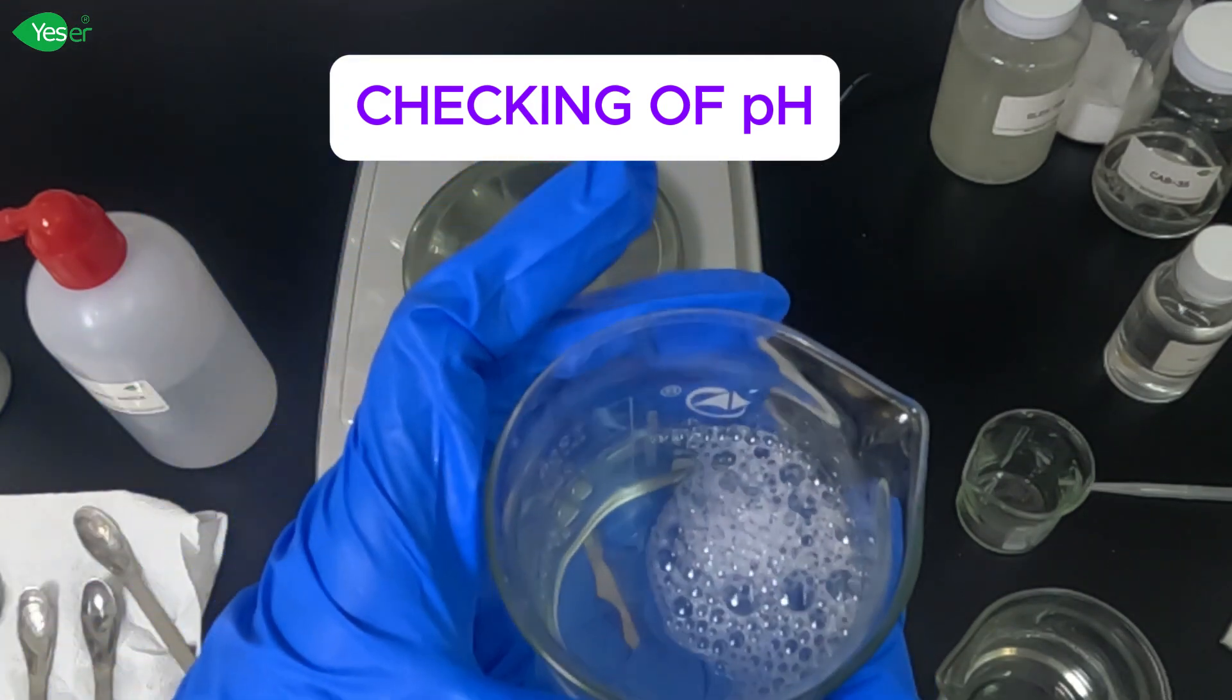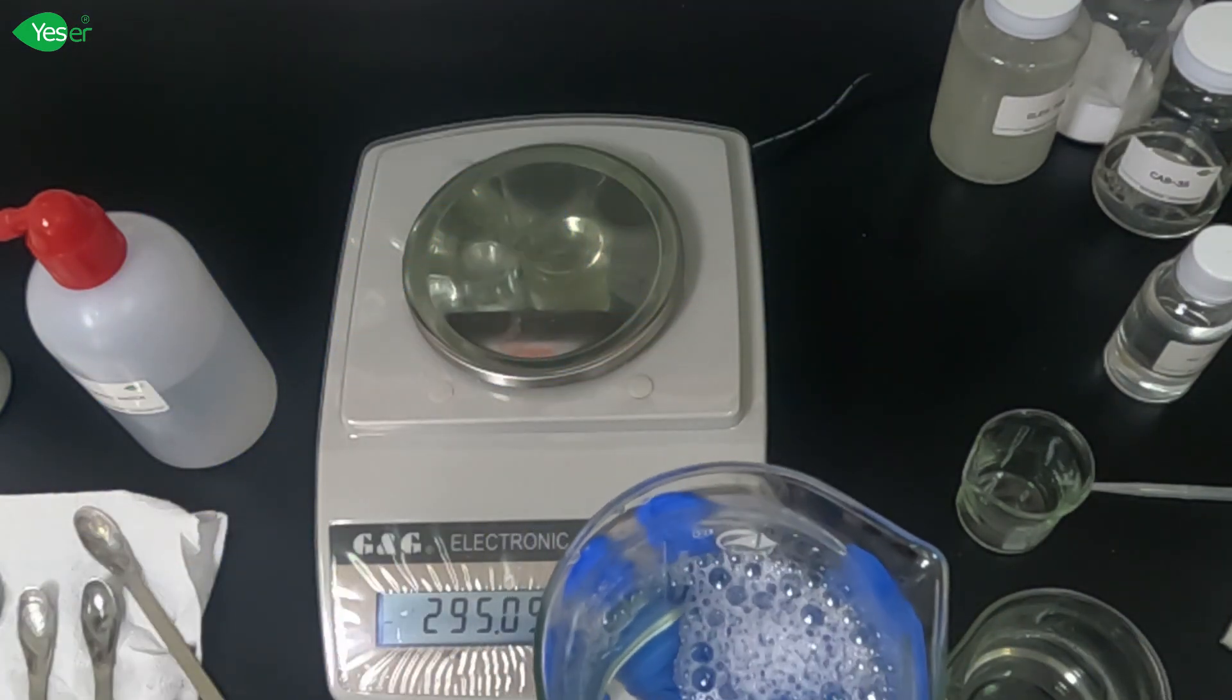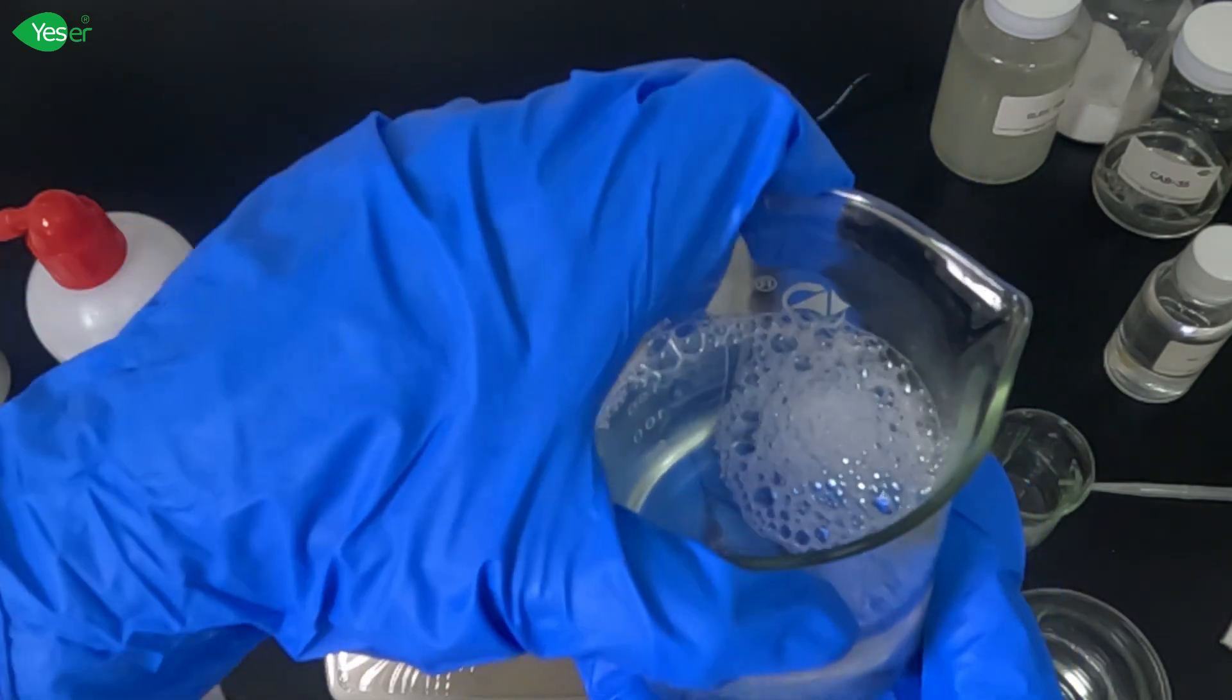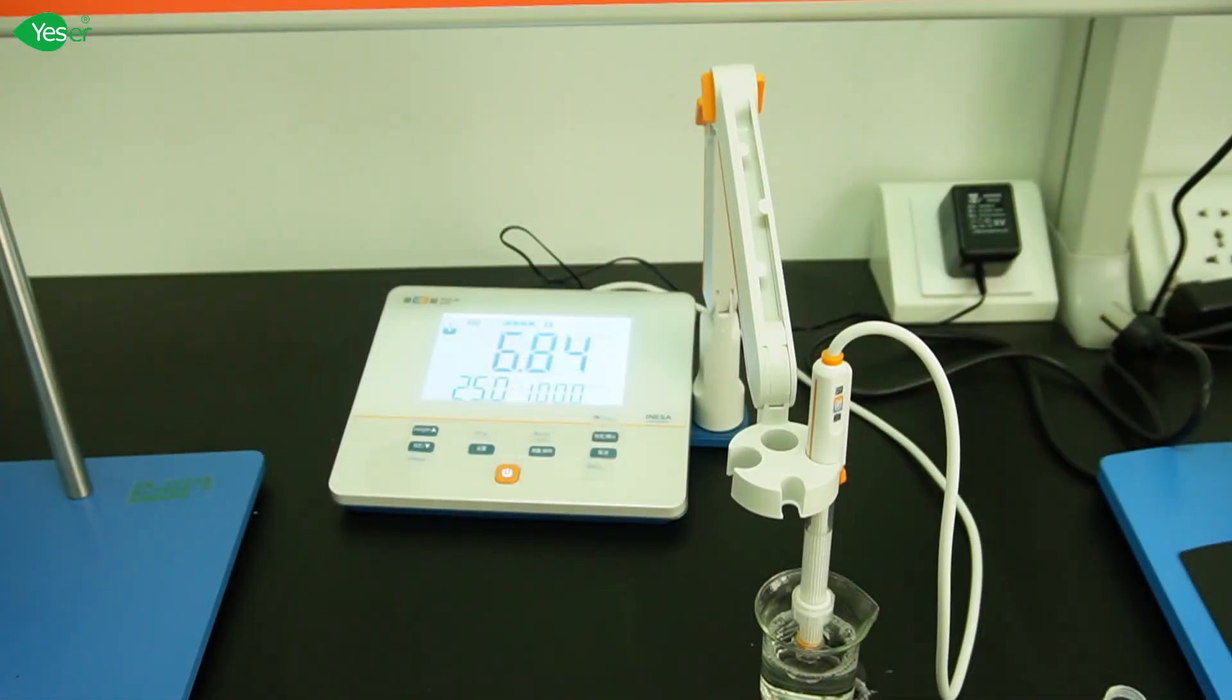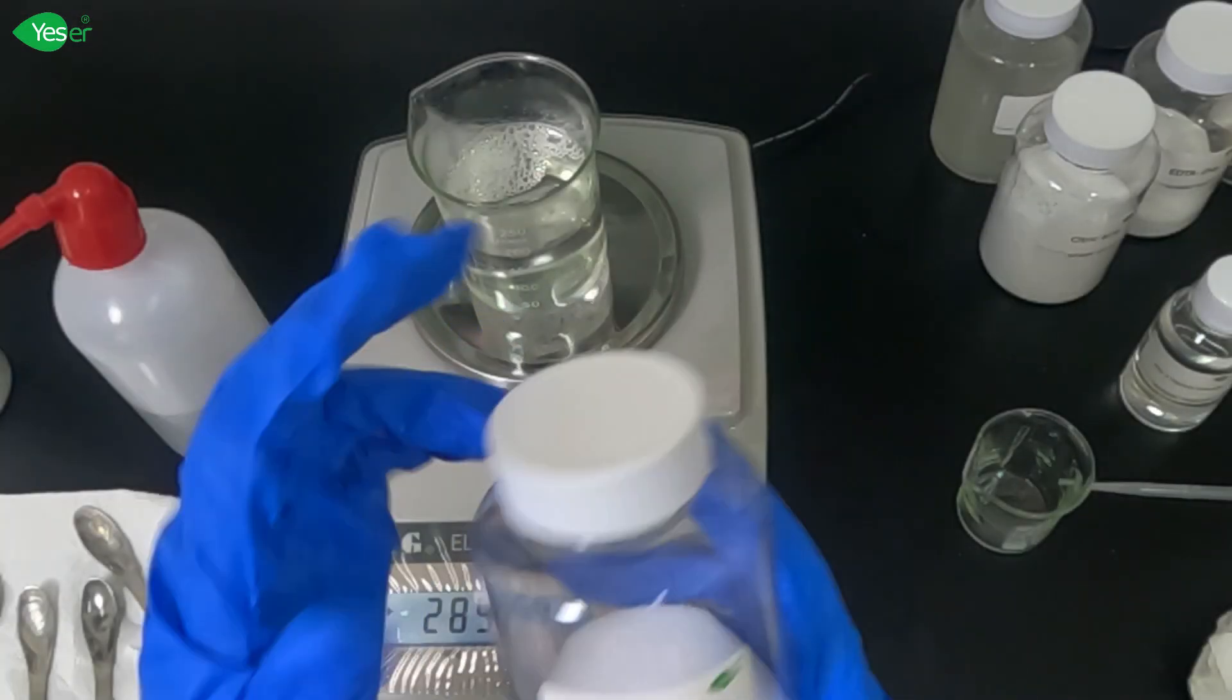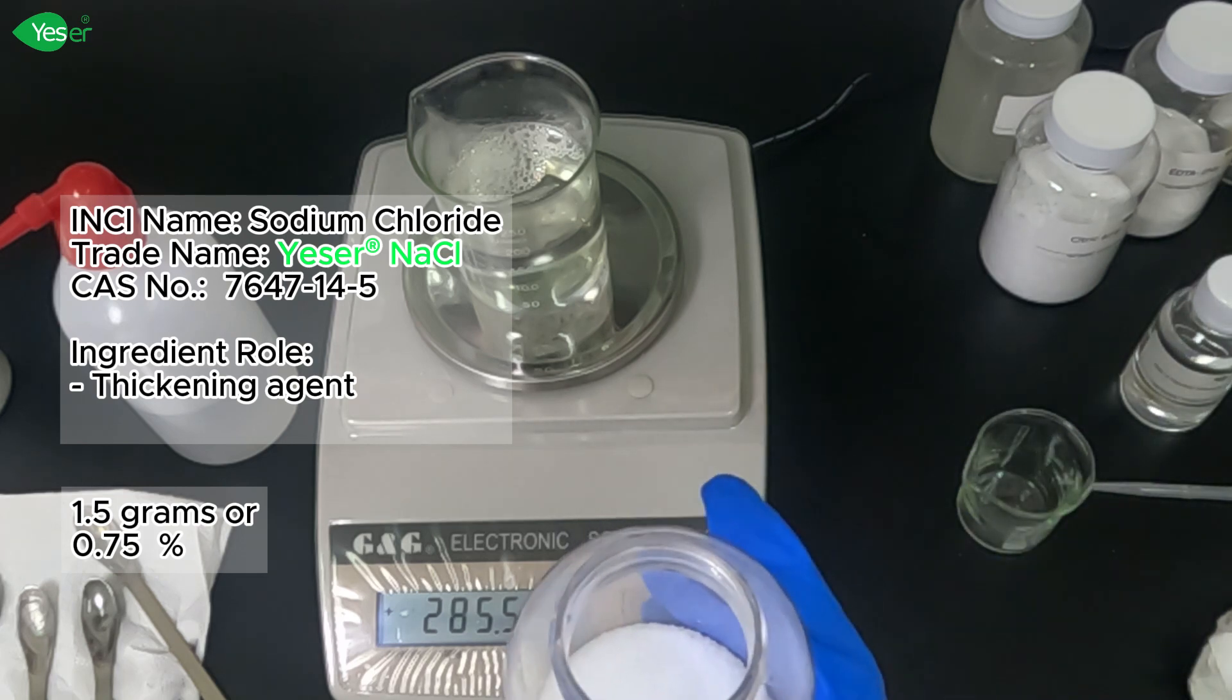Now let's check the pH of this formula. The pH range for this formula should be between 5 and 7, so we will adjust it with citric acid as necessary. Our pH is 6.84, which is within our range. We can now proceed to adding our salt or thickener for our formula. Let's add 1.5 grams of salt in our solution, gradually, until we achieve our desired viscosity.